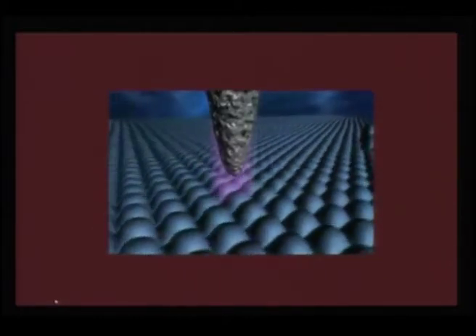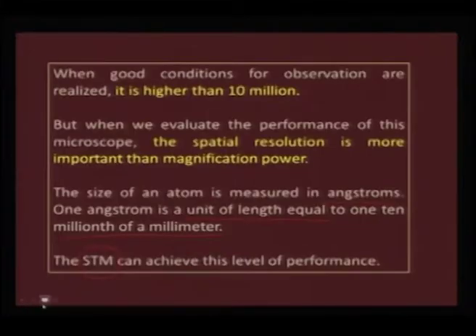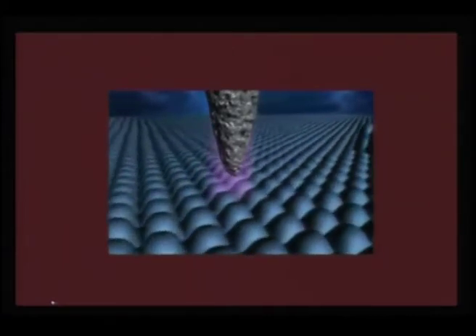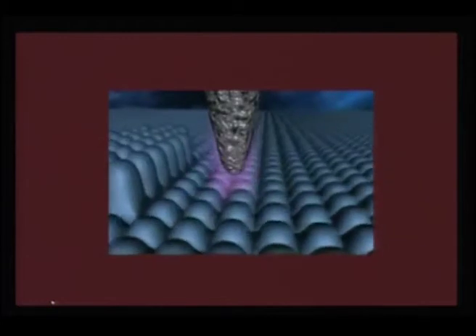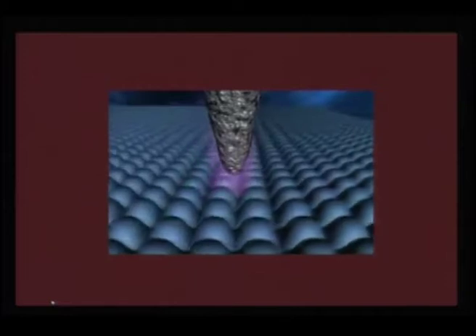And as you would see here, there is a tunneling that is achieved between the tip and the surface, and this can map. If there are any edges or steps, the tip can actually adjust itself to probe. Therefore, in a predominantly flat surface, any corrugations or step edges that are there can be mapped once you achieve a tunneling probability.